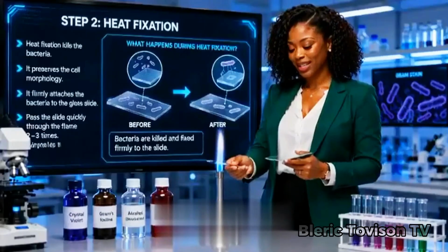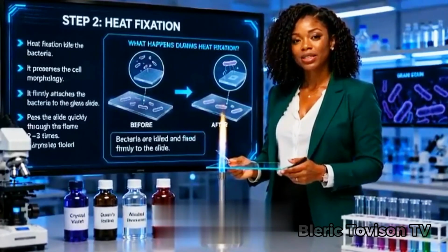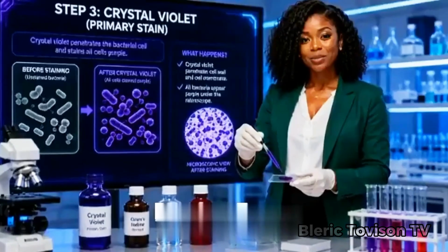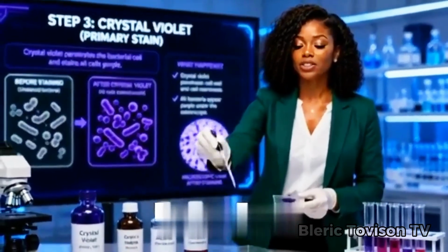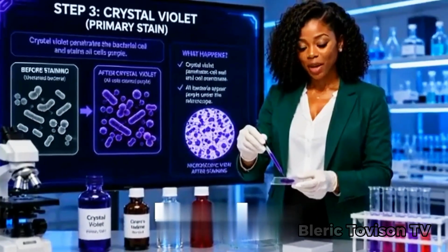After the smear dries, the slide is gently passed through a flame. This process, called heat fixation, kills the bacteria, preserves their shape, and firmly attaches them to the slide. Next, the smear is flooded with crystal violet, the primary stain, for 60 seconds and rinsed gently with water. At this stage, every bacterial cell absorbs the dye and appears deep purple under the microscope.